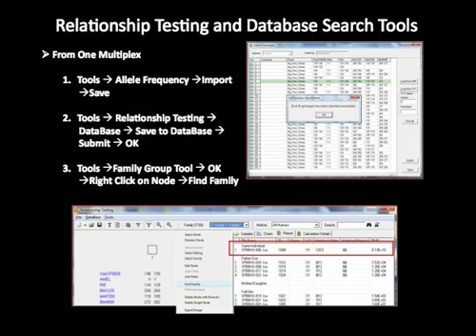Click on the database, Save to Database, Submit, and OK to save the genotype files to the database. Then display each file as a separate node using Tools, Family Group Tool, OK. You may right-click on the node and select Find Family.